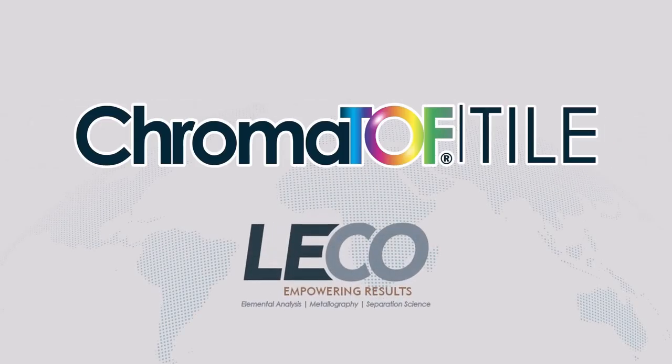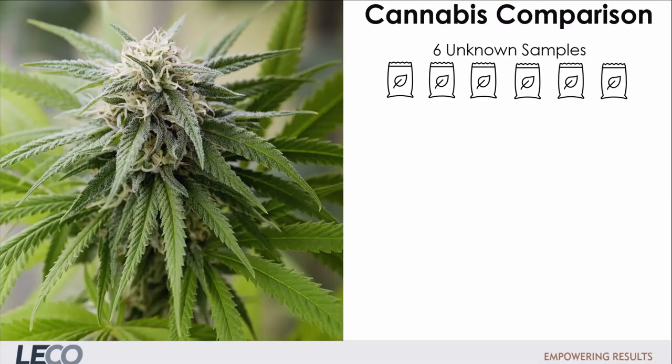LECO's ChromaTOF Tile can streamline data analysis to quickly find and explore differences between GCxGC samples. Here we're highlighting a project that used ChromaTOF Tile to compare 6 different cannabis samples. We didn't have a lot of information about the chemical details of each sample at the start of the analysis.